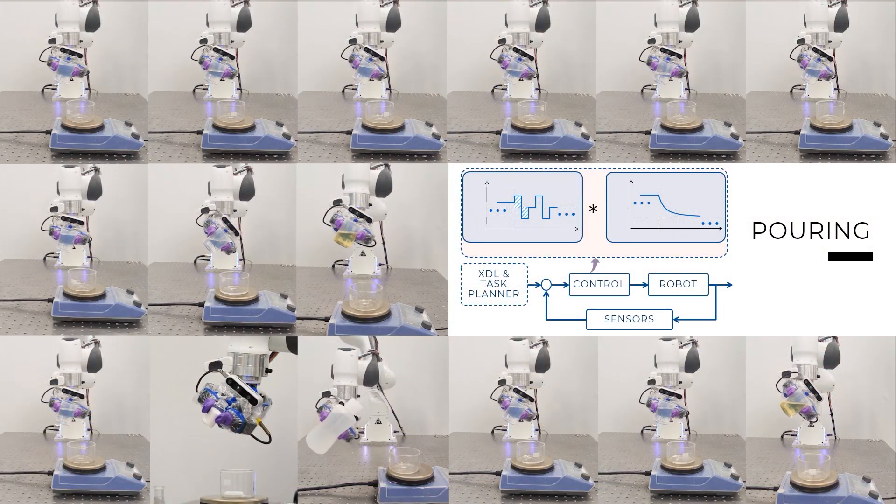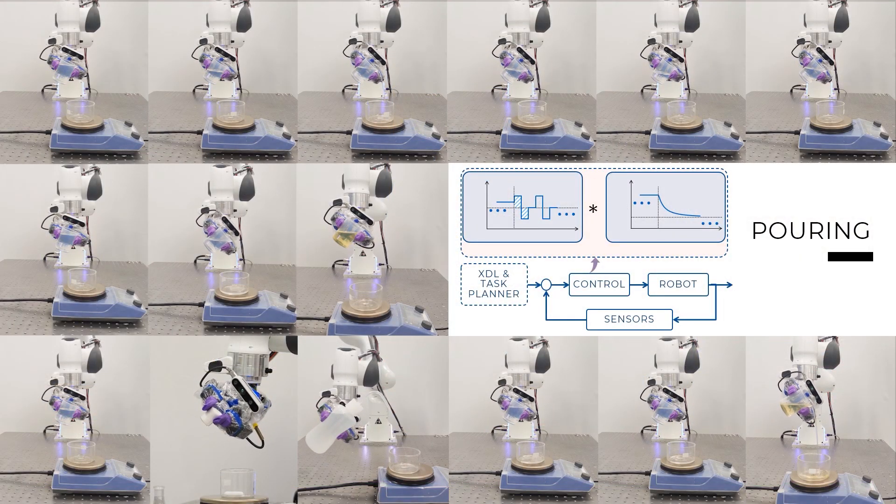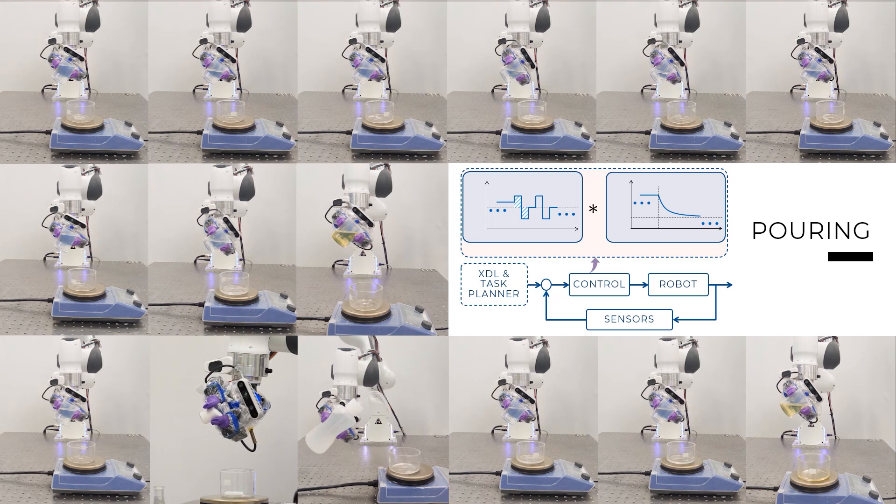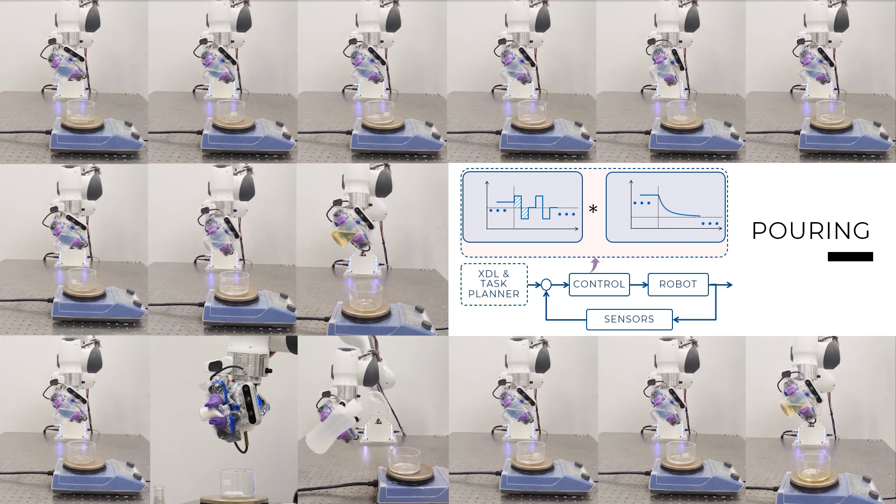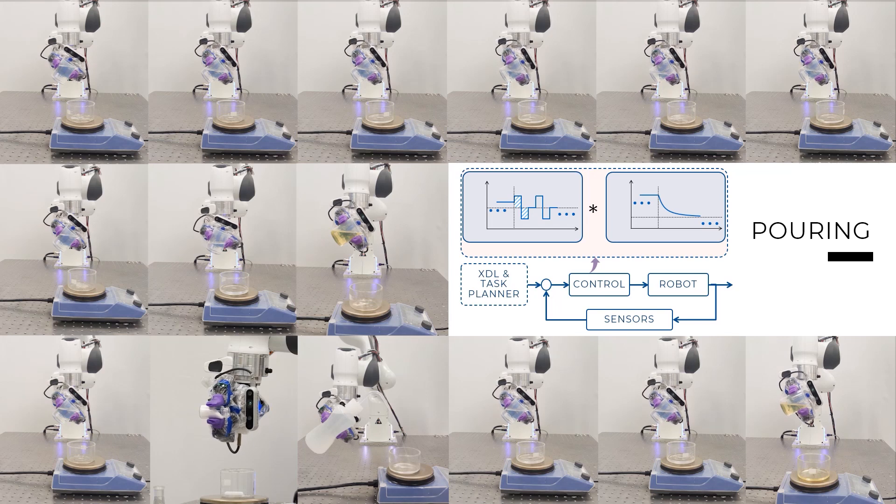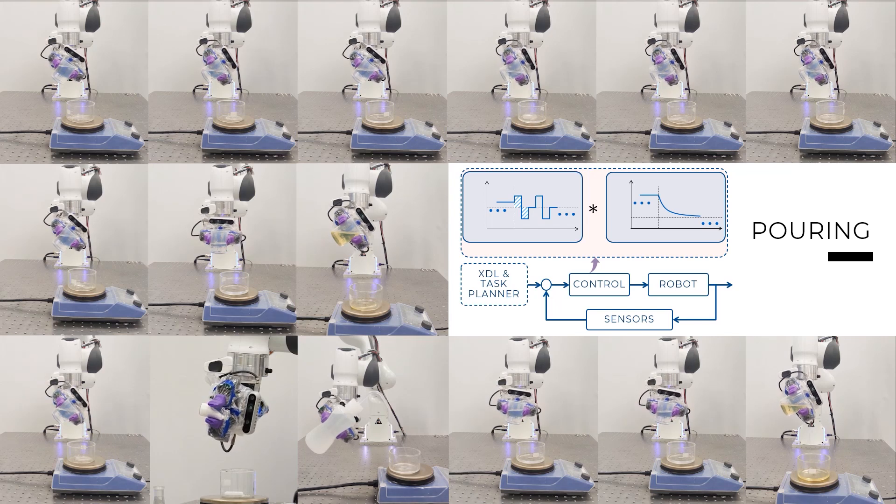We realize accurate closed-loop pouring skills by convoluting a PD controller with a shaping function that is inspired by human behavior for pouring. We use velocity control, and the variety of pouring skills can be seen in this video.